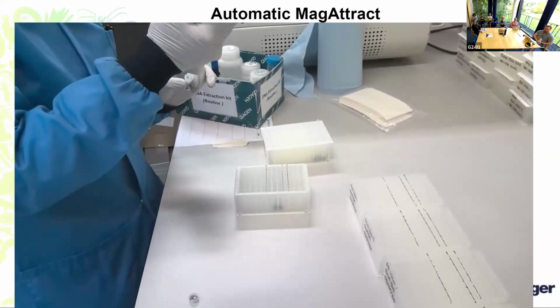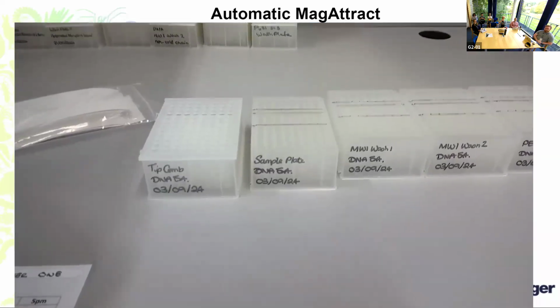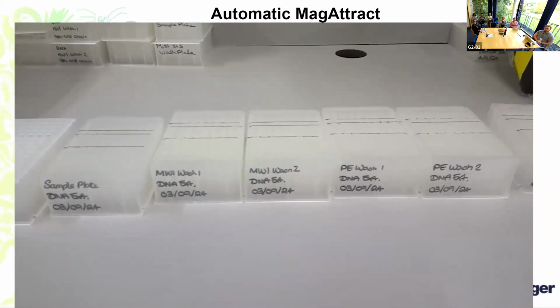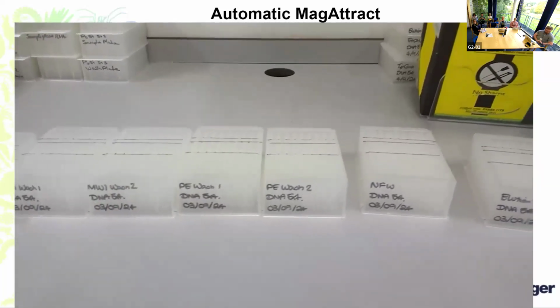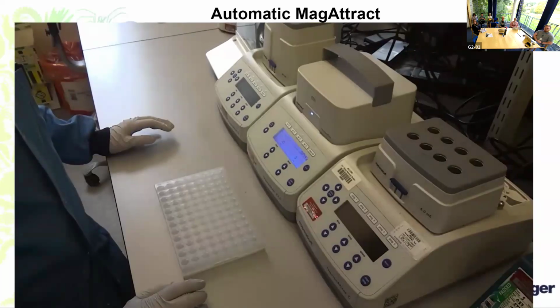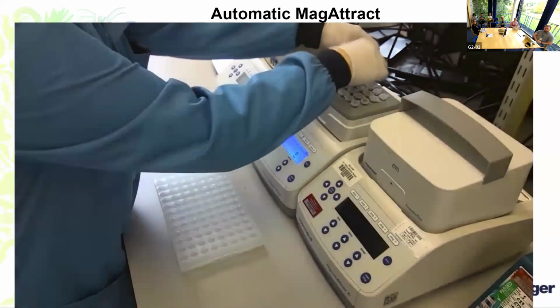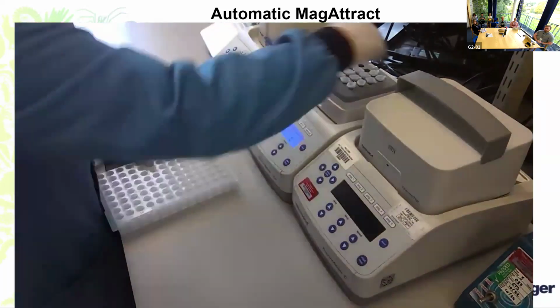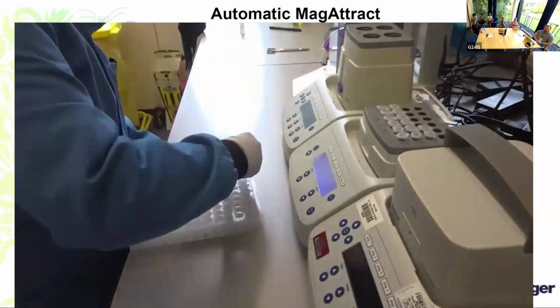So the Kingfisher works with a magnetic head, which goes into each of these plates. And we can see there's a plastic tip comb on that first plate there, which the magnetic head goes to. And then the extraction works by transferring magnetic particles, which the DNA binds to, into the different plates. There's mixing steps within each plate, which the wash buffers remove impurities from, and then the DNA is finally eluted in a volume of 130 microliters of elution buffer.